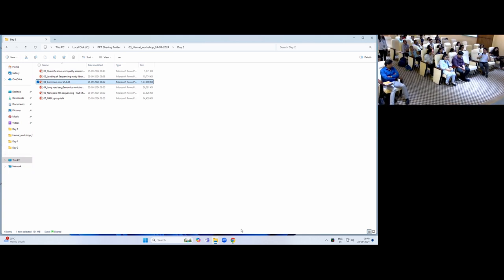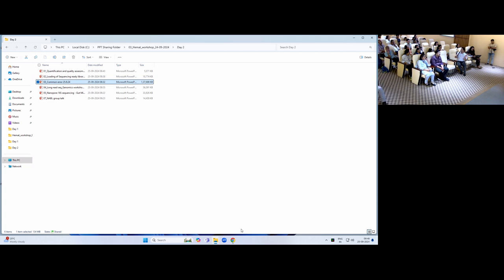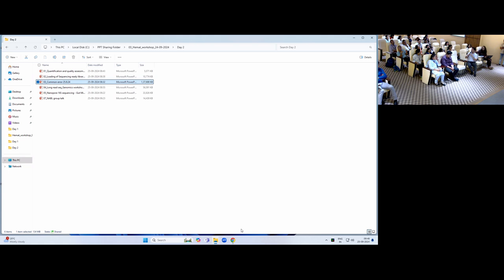So in some ways in which we prepare the library, we replace the standard Illumina sequencing motif and add our own motif. If you have read some of our papers in leukemia, we did this for FLT3. Previously we have done this for NPM1 mutation. So those are ways in which you can incorporate your own custom sequencing libraries.